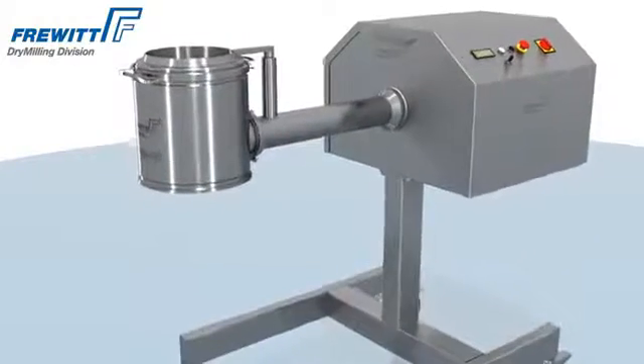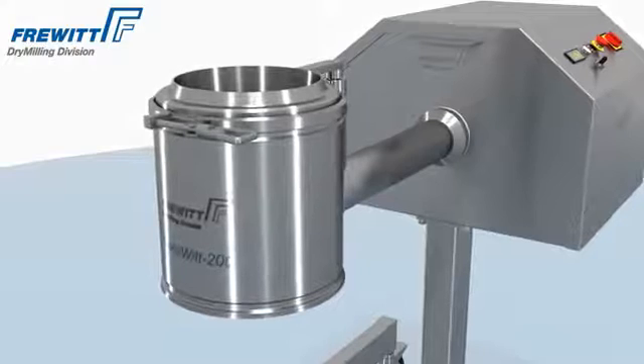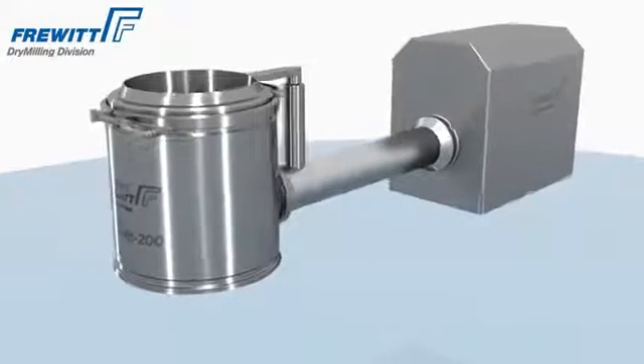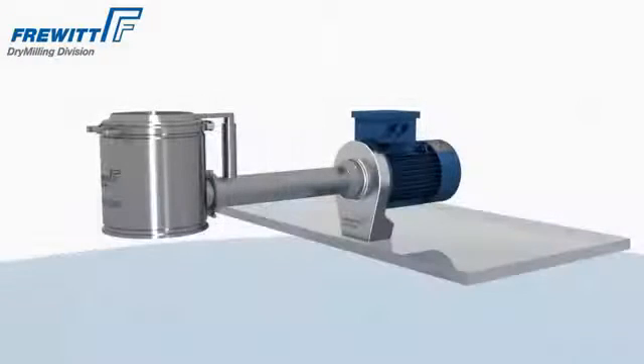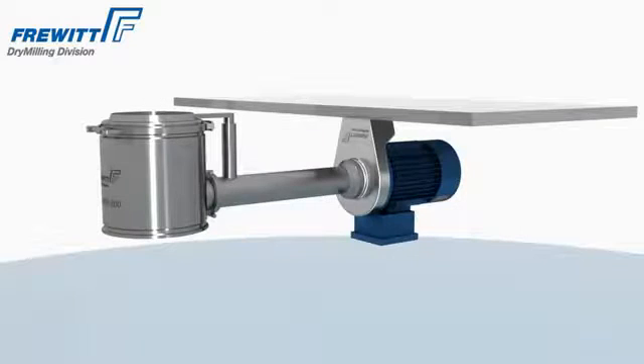Compatibility among all Frevit Mills is one of the compelling features. Employing identical drives, control units, and design, Frevit Mills cover nearly all your needs regarding installation footprint and product requirements.